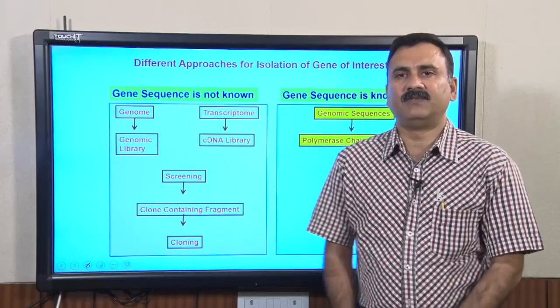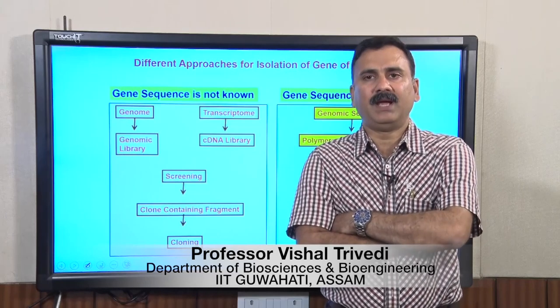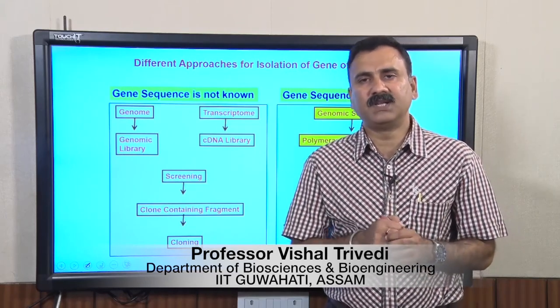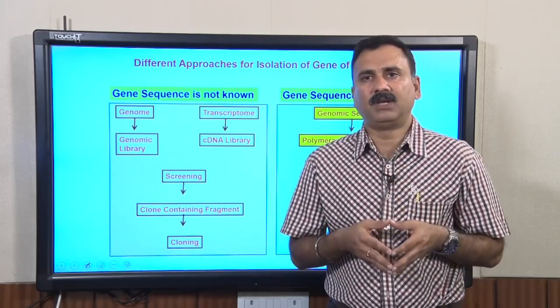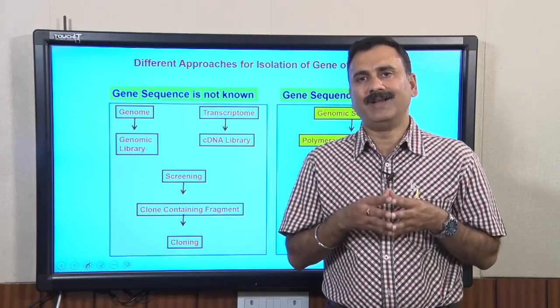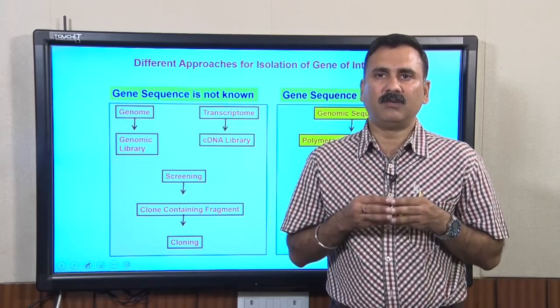Hello everybody, this is Dr. Vishal Trivedi from the Department of Biosciences and Bioengineering, IIT Guwahati. And what we were discussing was the isolation of a gene of interest from three different sources. And in this particular module, we were discussing how to isolate the gene by applying different approaches.